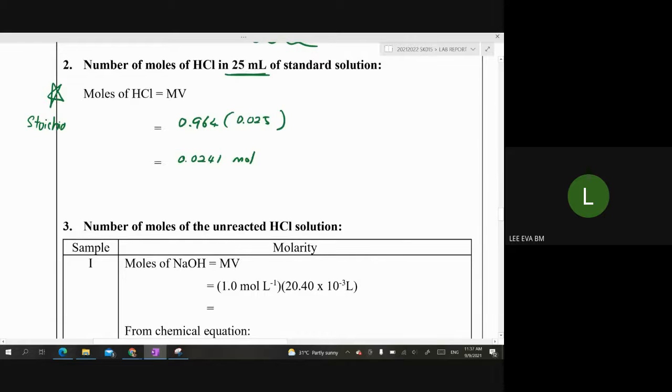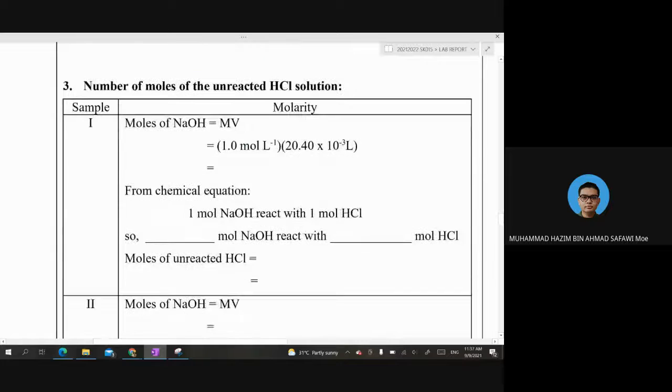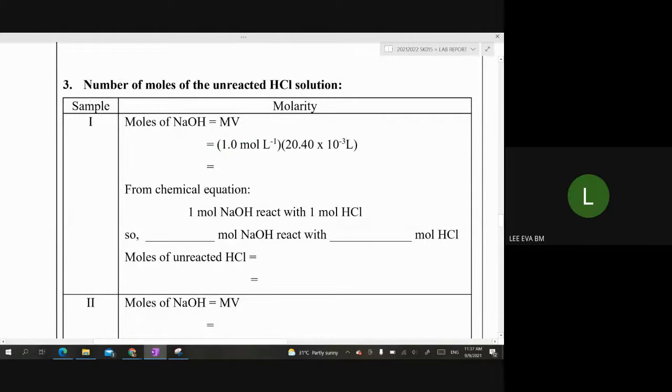Everyone's alright? Yes, madam. Okay. And then for this one, part number 3. Okay, if you still remember part number 3, we react the metal M with your HCl, then we got the remaining HCl solution.